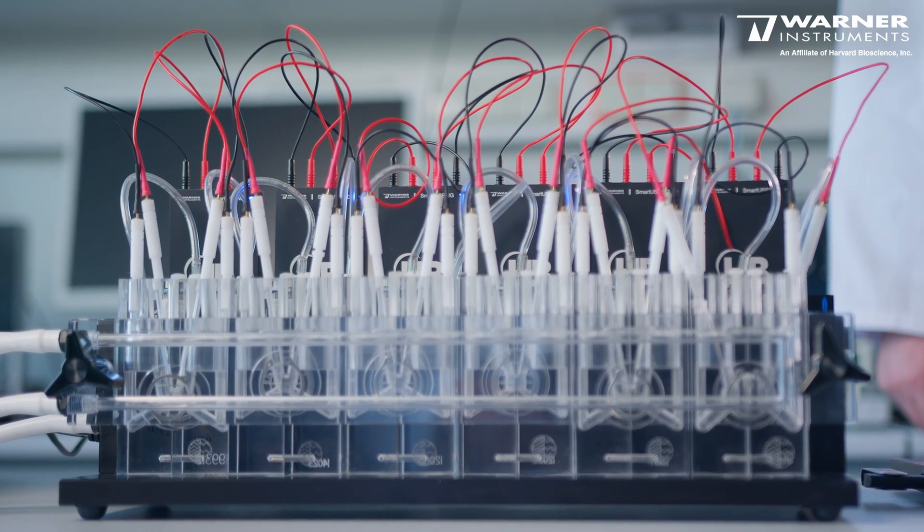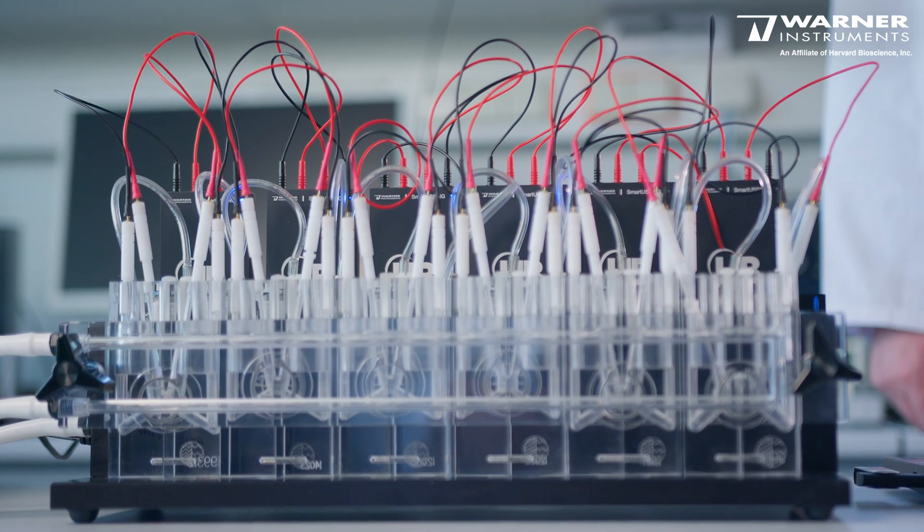Each amplifier also has the possibility to operate one Ussing chamber in a standalone Ussing experiment, so you can run up to six individual Ussing experiments on one block. The Smart Ussing system is also very easy to scale according to your needs — one holder can house up to six amplifiers and six chambers, so you can start with only one amplifier and one chamber or buy the full stack of six.